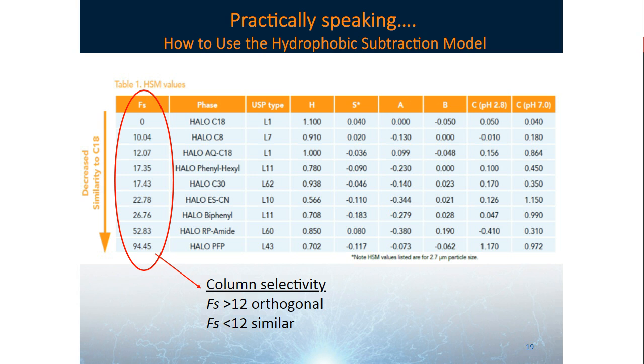So I think just to clear any confusion up there, maybe you were thinking about the Tanaka. Let me push that. But in terms of the hydrophobic subtraction model, the C18 and AQ-C18 are really pretty similar.